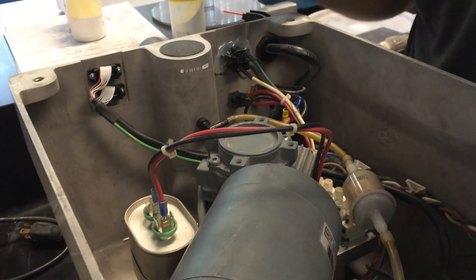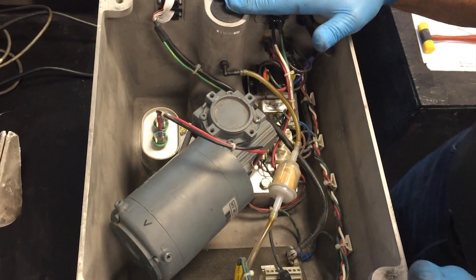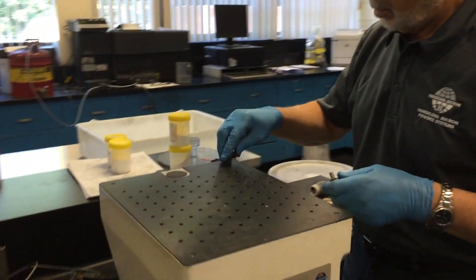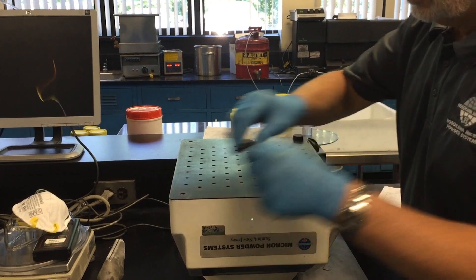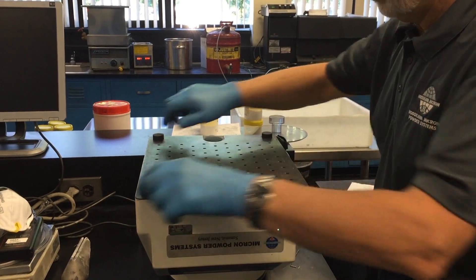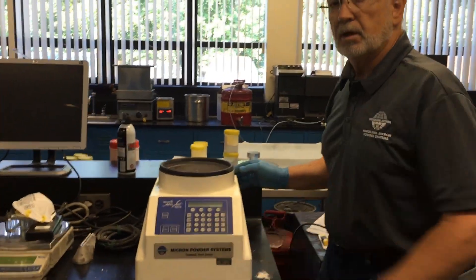I typically take and inspect the machine just to see if there's any missing parts or any lost components. There doesn't seem to be any, so I'm pleased with it. I then take the bottom plate, put it back into position, and re-thread the mounting feet. Rotate the machine back over, plug it back in, and you're ready to run. Thank you.